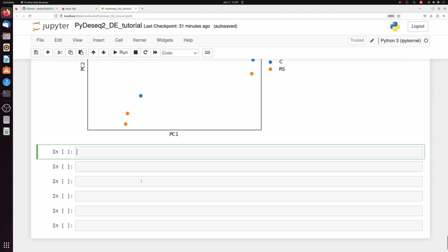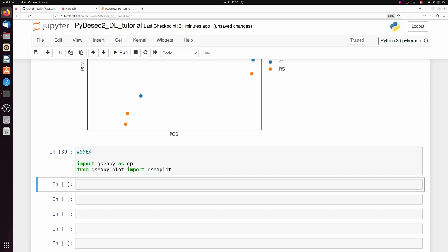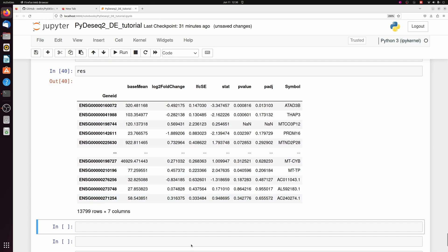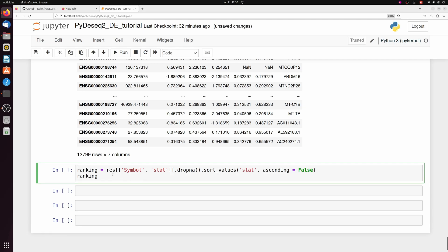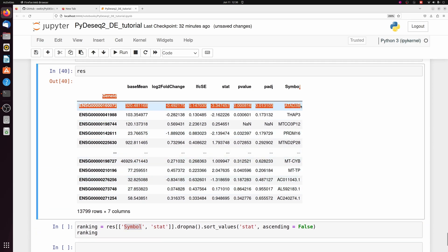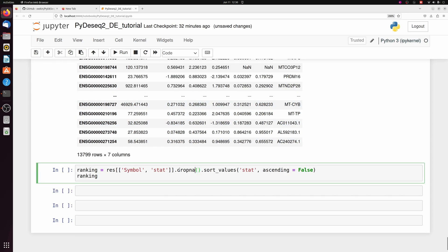But anyways, let's do some typical downstream stuff like GSEA. For GSEA, I'm going to use GSEAPY. So again, we have our res data frame, which is all the genes detected in our data set, whether they were differentially expressed or not. We're going to make a new data frame called ranking. And we're just going to take the symbol column, which is the one we added, and the stat column. We're going to drop the NA values, and we're going to sort by stat with the largest on top.